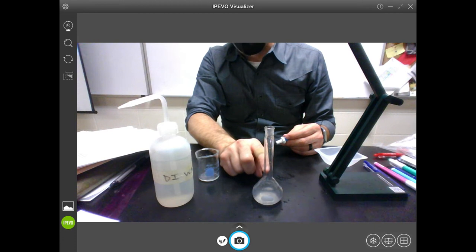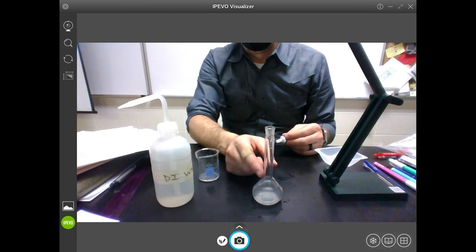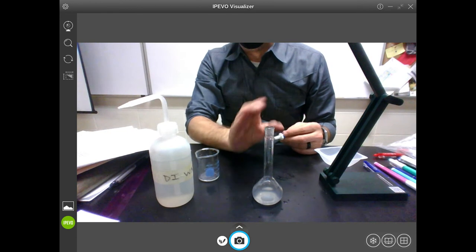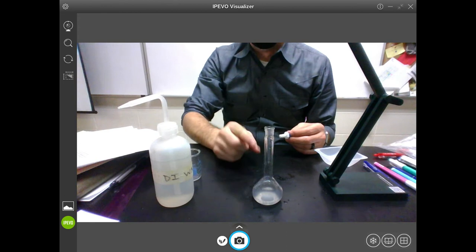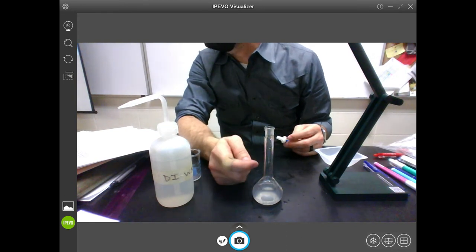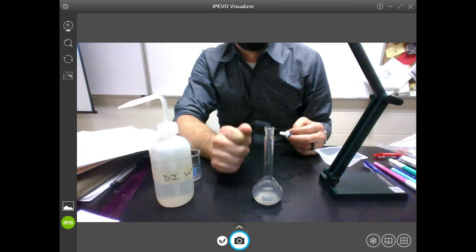when it fills here, when it hits this neck, that's a small volume diameter. It's gonna fill fast. And the one thing you do not, under any circumstances, want to do is blow by that line. You blow by that line, you fill it past that line, you're screwed. You got to start all over again. There's nothing you can do.